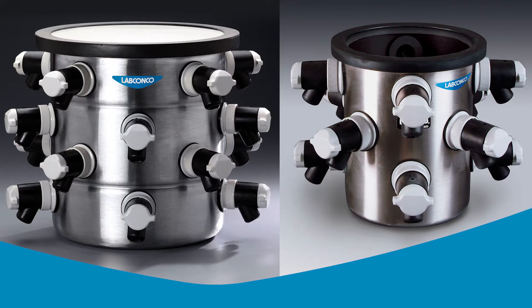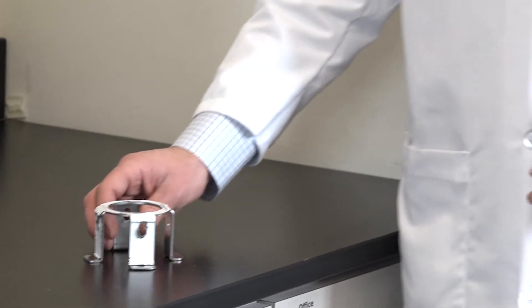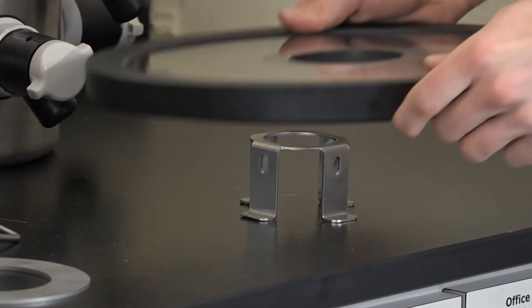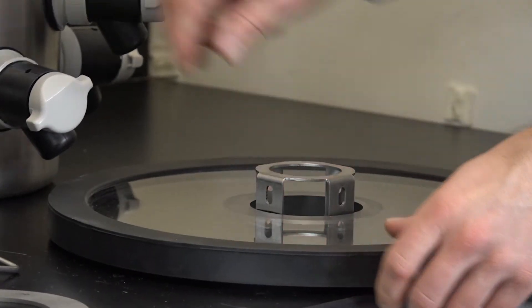Here's how to install a 12 or 16 port drying chamber. Unpack the drying chamber and remove the white protective film from the centering collar. Lift the lid off of the collector and place the collar beneath the middle hole.